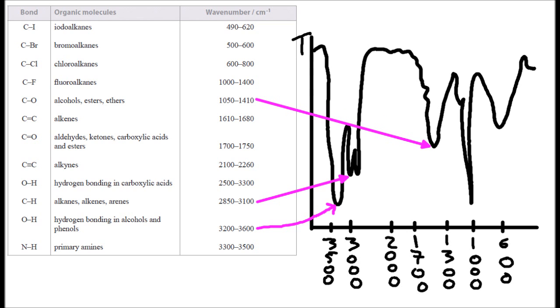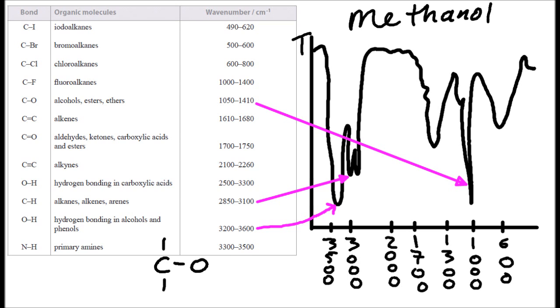And I'm not sure which of these two peaks could be the alcohol. And that's a little bit how infrared spectroscopy goes. There's all these kind of lines all over the place. And not all of them seem to make sense, but the IB is going to fix it for you so that every line pretty much is going to have its place. Now, I've showed you a real spectrum there, but they'll give you kind of fake ones that look nice.